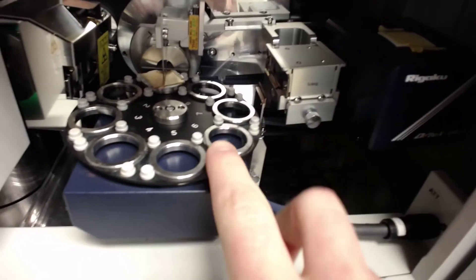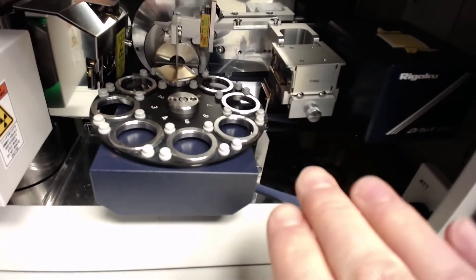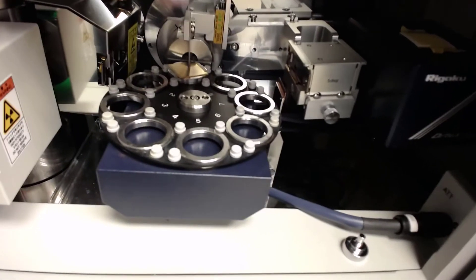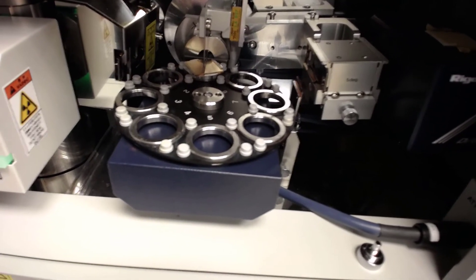And then the detector and the auto sampler will actually tilt and rotate about the center of the sample to change the angle.